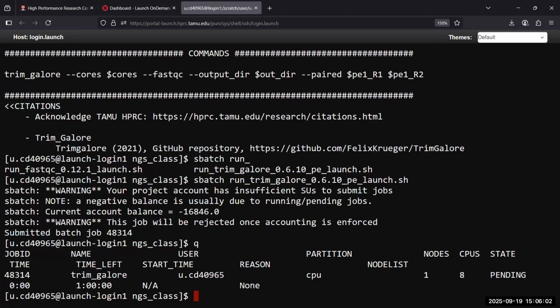Okay, see, there's two file options. Which file do you want? You want to do the trim? So type in the letter T and hit tab. And then I'll see. Yeah. Now see, it just went into the screen. Now it's using the same input files as the other script. So now you want to submit it. Just type in sbatch.